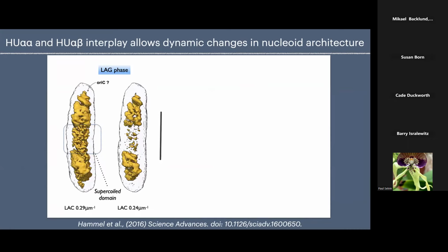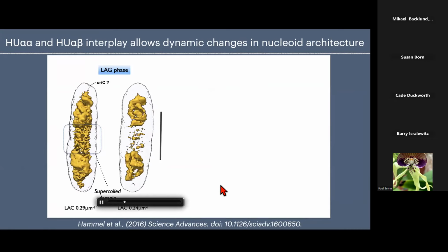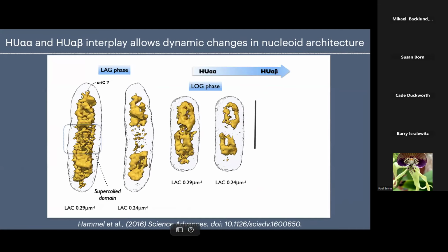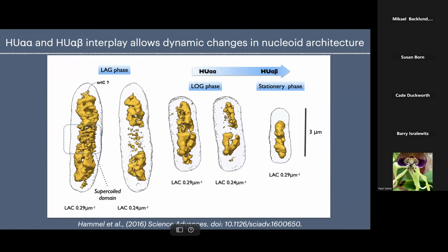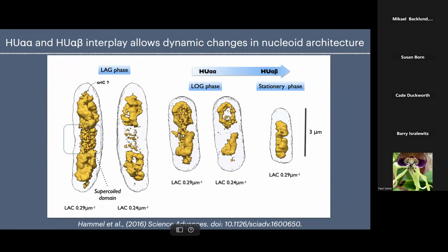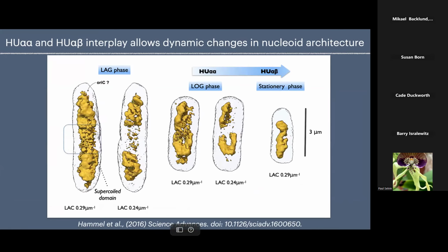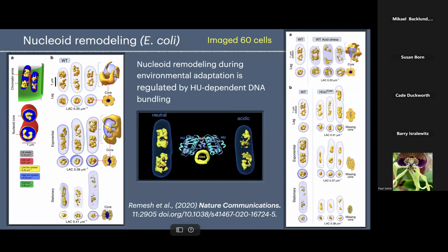In a specific mutant on the DNA, they don't have a difference between heterochromatin and euchromatin. They were looking at this supercoiled domain and looking at the 2 different regions there. And when you switch from one strain to another, you flip the ratio, and in the stationary phase, it's all one type. The bacteria itself is shrunk in length. So this is the nucleoid of bacteria, which you wouldn't get from other technologies. Again, they looked at other treatments of these bacteria and combined it with SAXS measurement to look at the structural change that occurs in that particular molecule, small angle scattering.